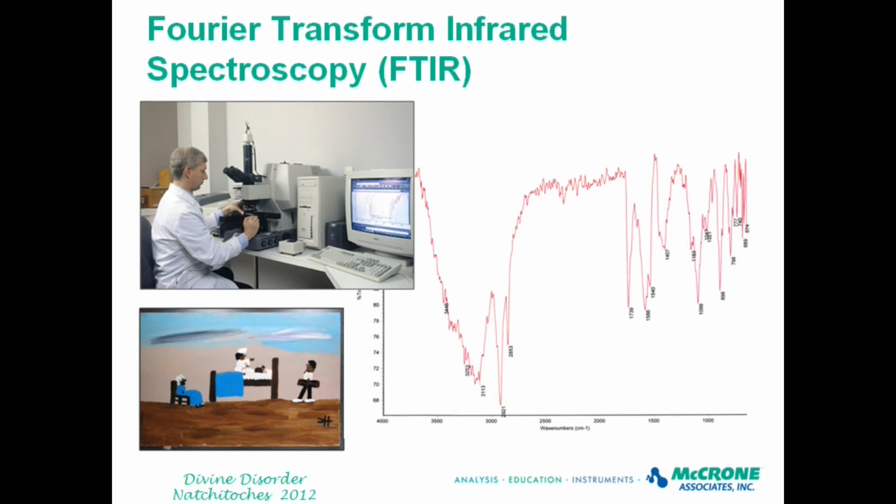And this one, for example, has calcium and phosphorus and is a good signature for bone black. We also used Fourier transform infrared spectroscopy, or FTIR, very commonly used instrumentation, and it provides information about organic materials, which, of course, if you're doing elemental analysis, is not going to give you much information. But this gives you a spectral signature, and this allowed us to identify, for example, that all of the paintings that we examined, both the Clementine Hunters and the questioned ones, were all oil paintings. So again, we were dealing with apples and apples and not a mixture of different kinds of materials.